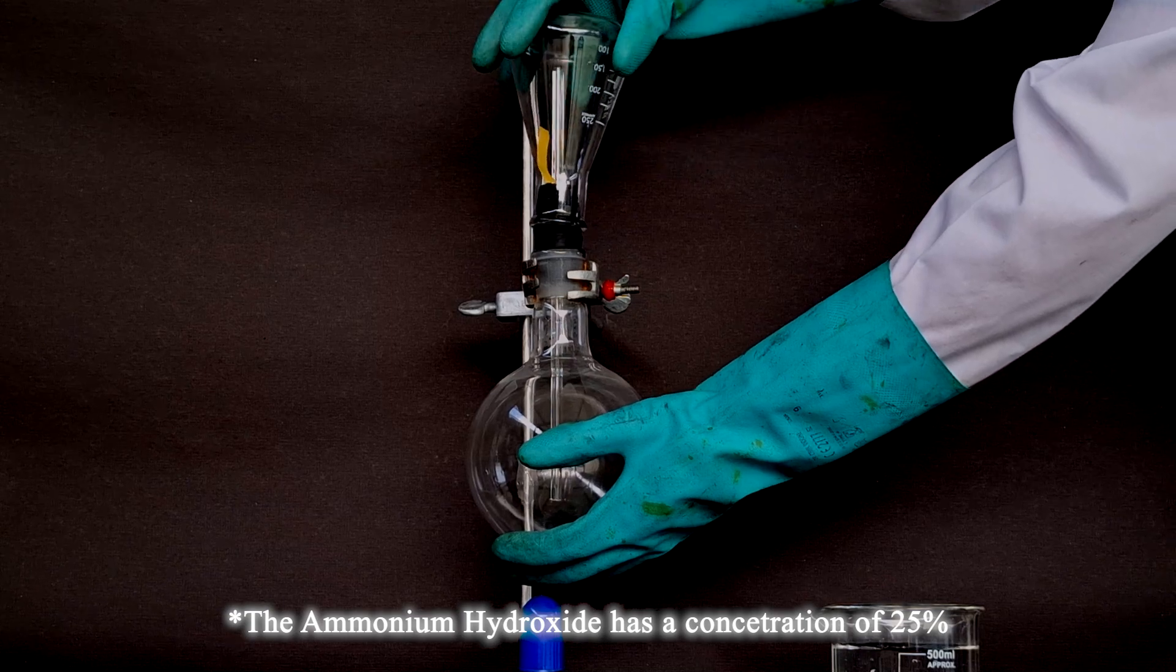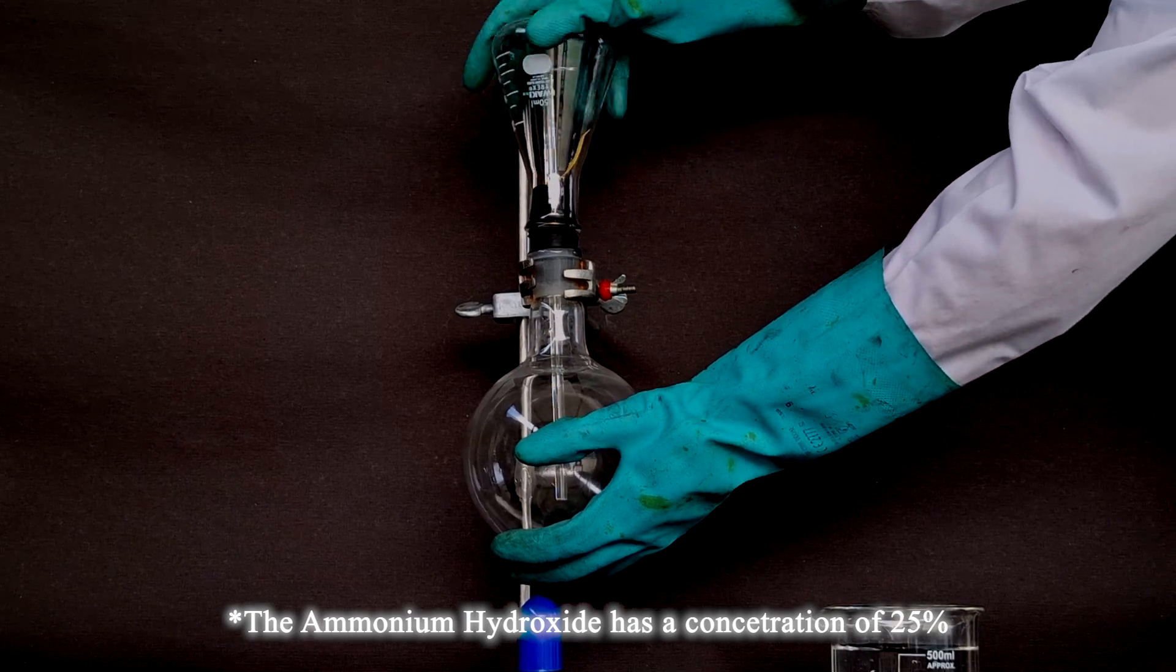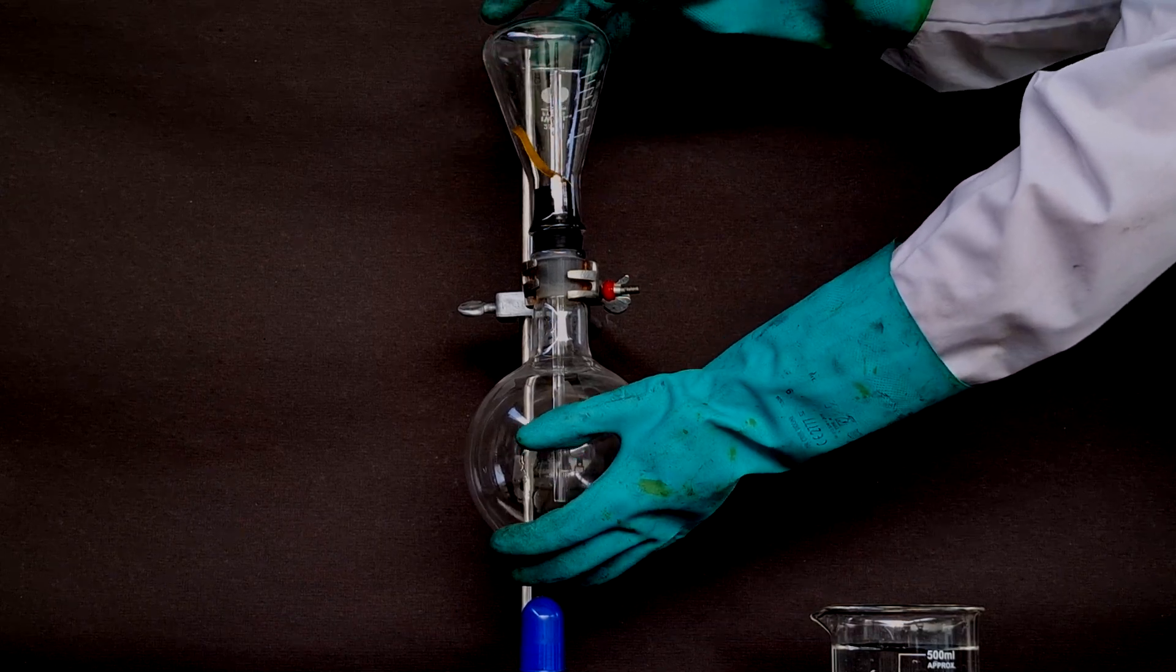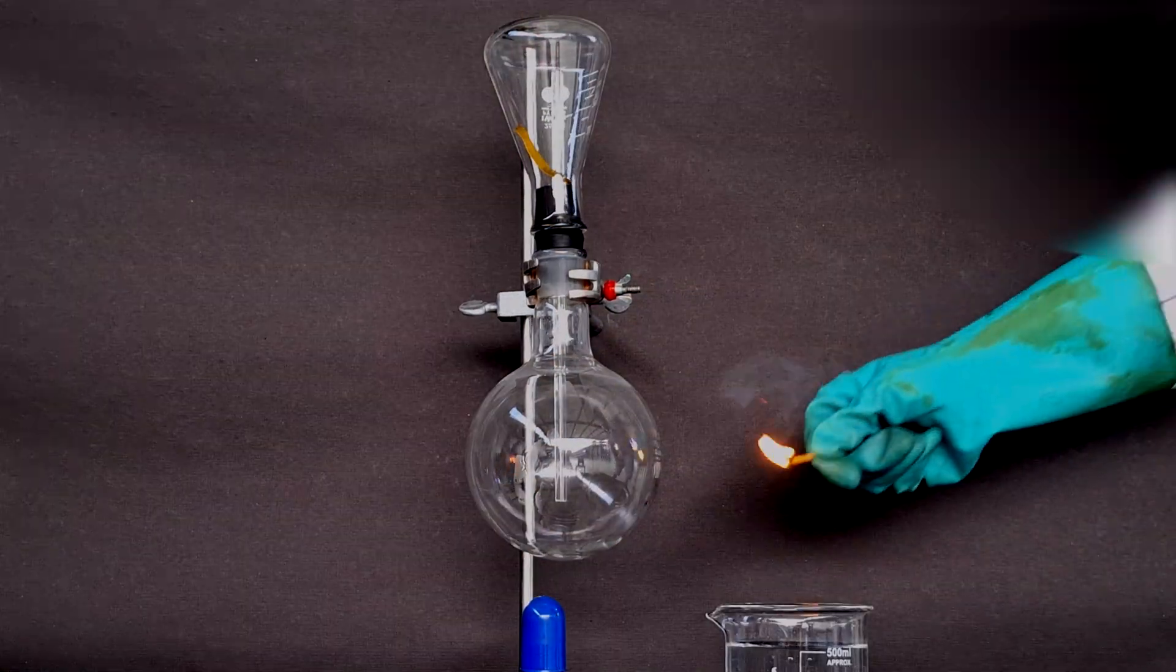An Erlenmeyer flask is attached above the round bottom. This is where the fountain will take place. I also added an indicator paper inside the flask to indicate the presence of ammonia gas.